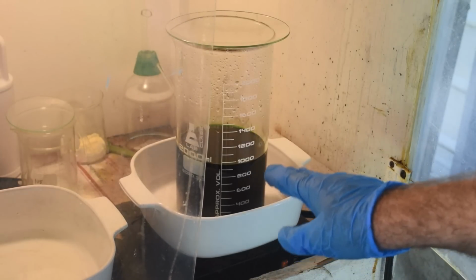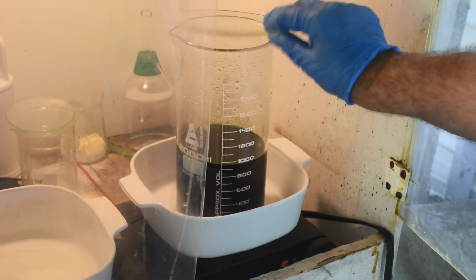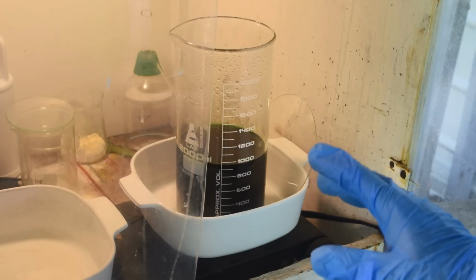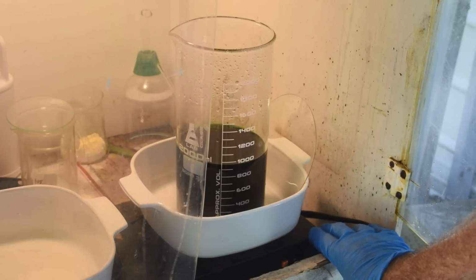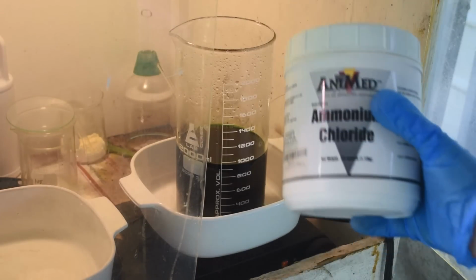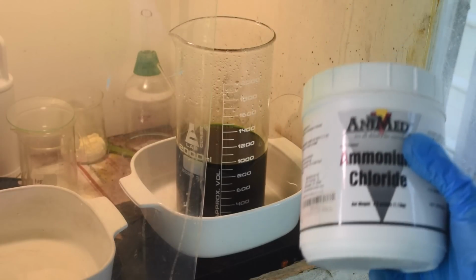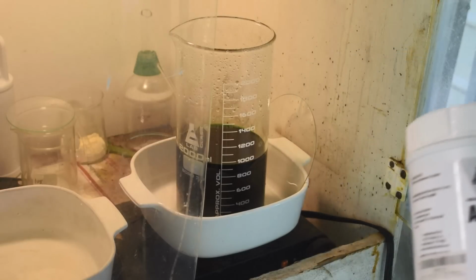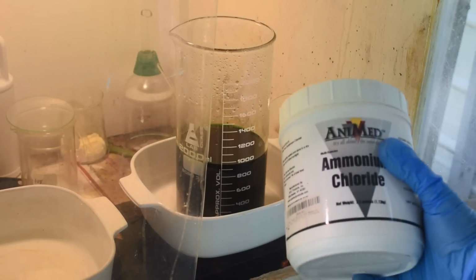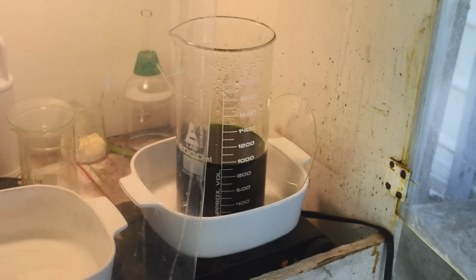So I've got a liter of this filtered liquid in this tall beaker. Note, tall beaker, that's important. And I'm only going to do a liter of this at a time because there is a good potential for boil over here. So first thing I'm going to do is warm this stuff up. I don't want it super hot, I just want it warm because we are going to dissolve as much ammonium chloride in it as it can handle, basically until no more will dissolve. And when you dissolve ammonium chloride, it's an endothermic reaction, meaning the liquid gets cold. And the cold liquid doesn't hold as much. So we're going to heat it up a little bit, and we're going to dissolve as much of this in it as it can take.